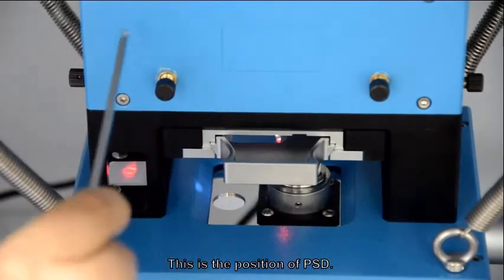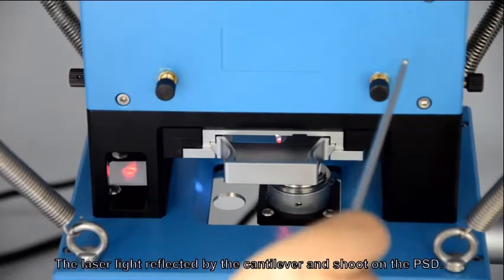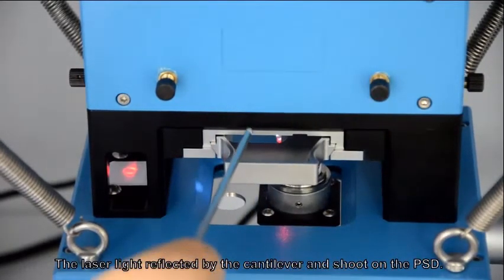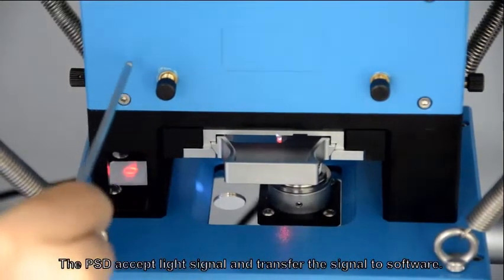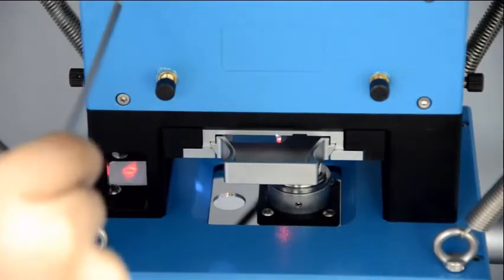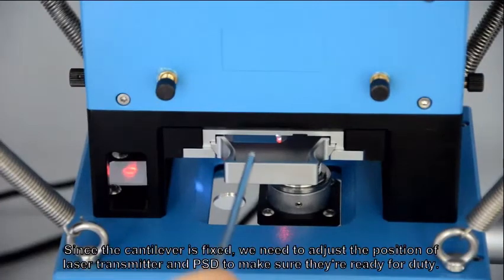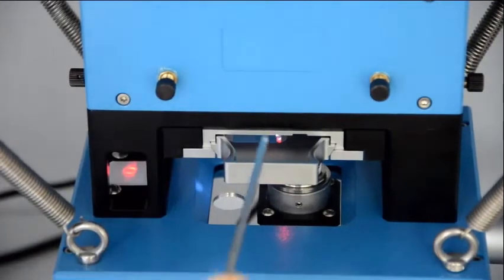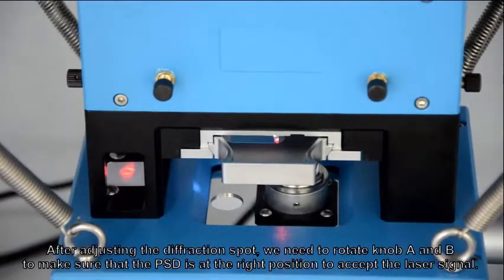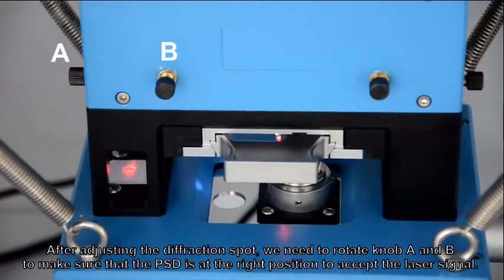This is the position of PSD, and this is the position of the laser transmitter. The laser light reflected by the cantilever shoots onto the PSD. The PSD accepts the light signal and transfers the signal to the software. Since the cantilever is fixed, we need to adjust the position of the laser transmitter and PSD to make sure they are ready for duty. After adjusting the diffraction spot, we need to rotate knob A and B to make sure the PSD is at the right position to accept the laser signal.